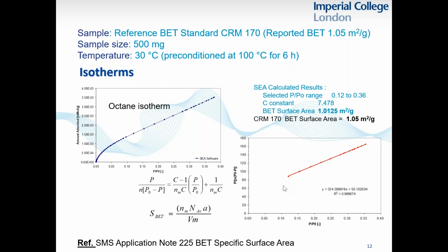So this is something quite simple, but again, if you're dealing with low surface area pharmaceuticals, and if you've got materials that are 10 or 20 microns, they will be low surface area, then this IGC technique can give you very accurate surface area determinations.